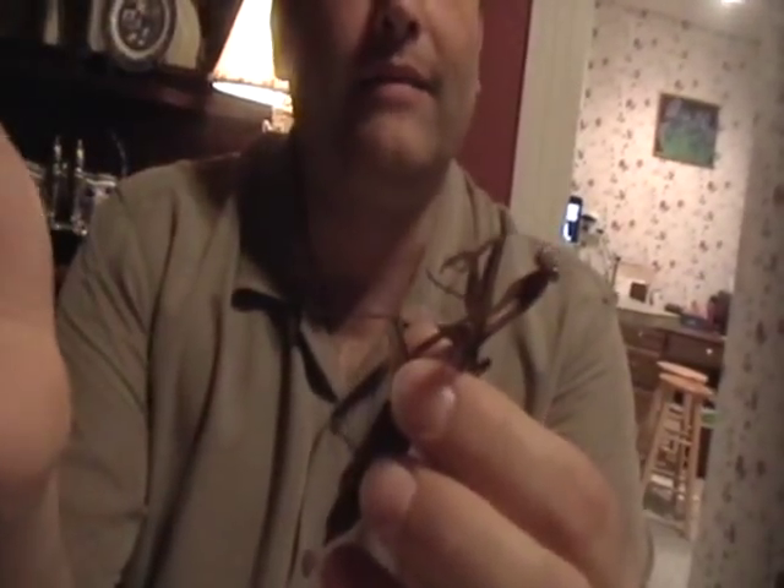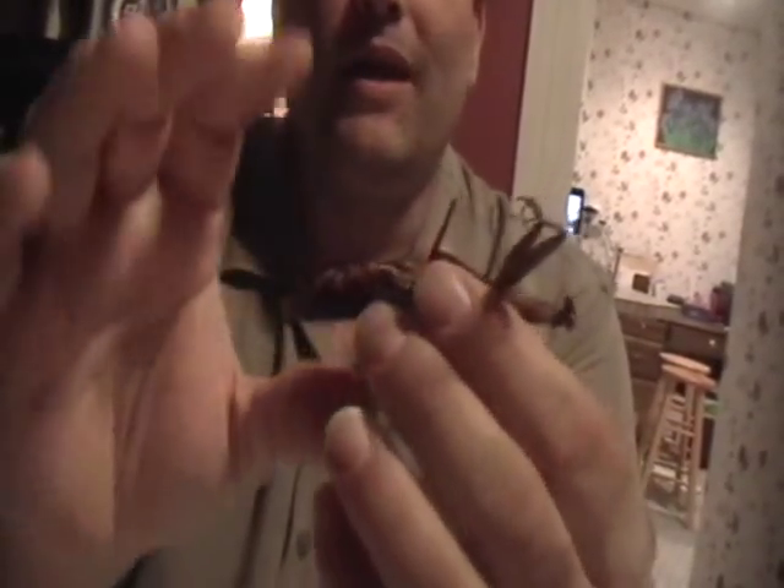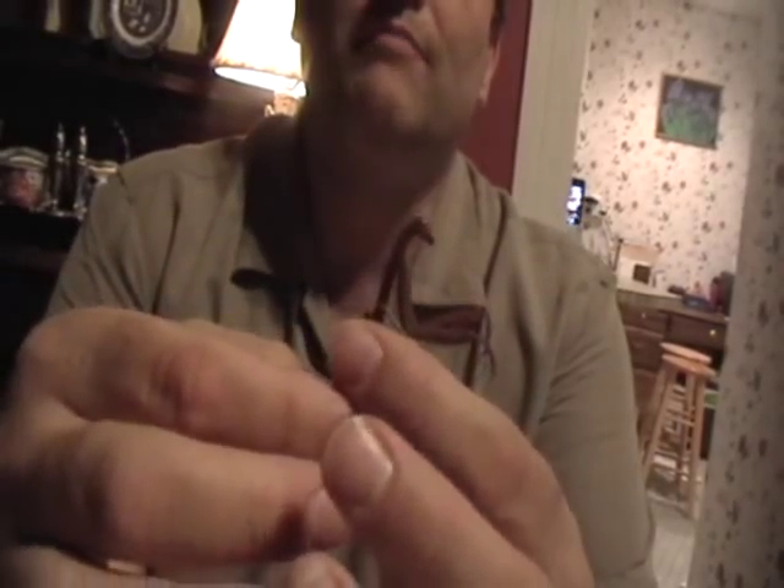If I were to push on that, the legs would break. And this is a problem because if I wanted to pin it, a lot of times you're going to make it so that the legs break. It's just more difficult to pin. In this case, I want to be able to put this inside of an insect envelope, and when I close the envelope it'll break the legs. So this is where I use the insect appendage relaxing fluid.